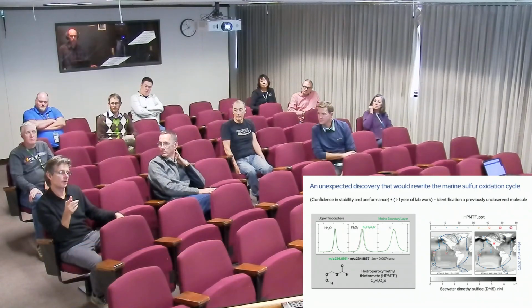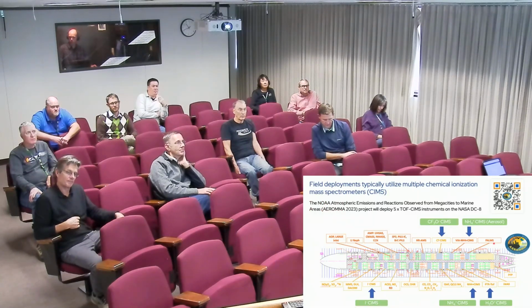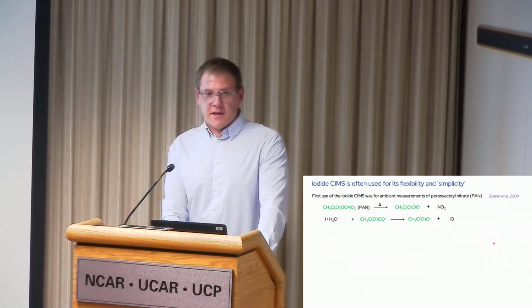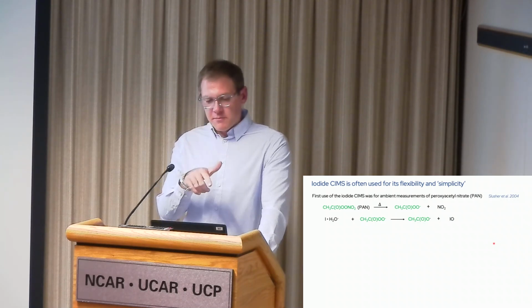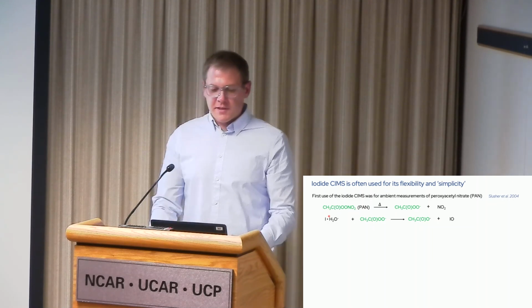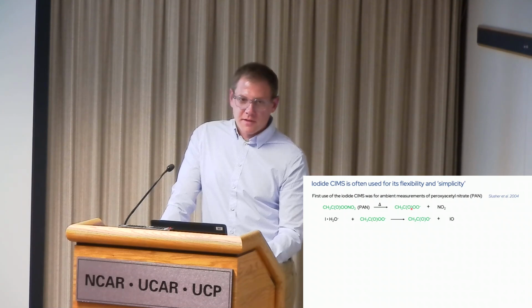Yep, Eric. Just to follow up on that, how do you get PAN if you're heating up your inlet? Yeah, PAN. I mean, the PAN sequence. Originally, we detected PAN with iodide CIMS, directly as a cluster. If we took PAN with iodide water and got an iodide-PAN cluster, it has very, very weak sensitivity. You almost can't see it. Turns out if you heat PAN up and decompose the NO2 off, and you let it go through this chemistry, you can detect it on acetate, but we also find that you can detect this peroxy radical, which is an interesting thing because now we're talking about detecting peroxy radicals in the atmosphere also.